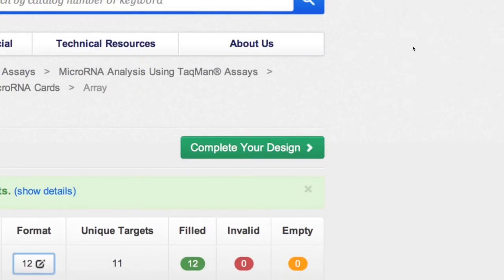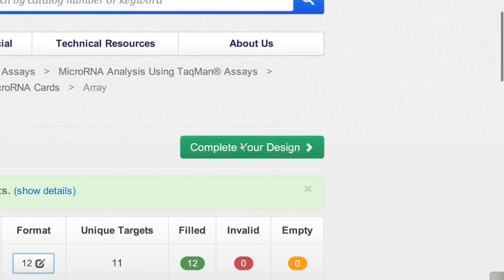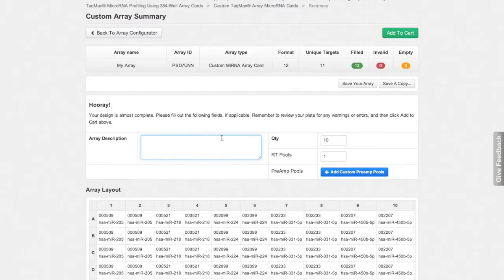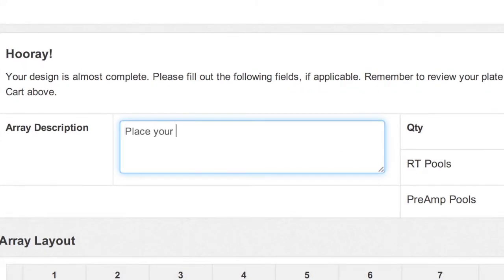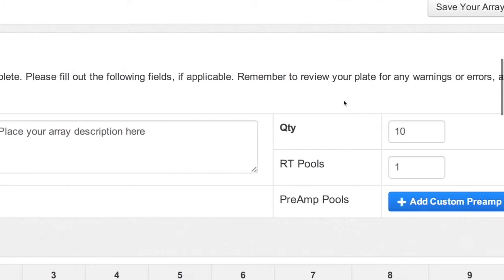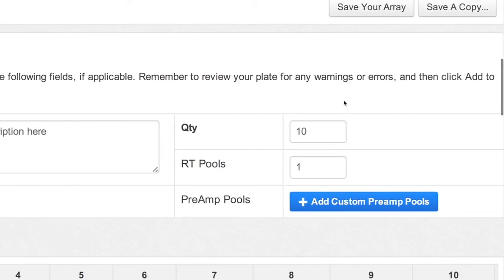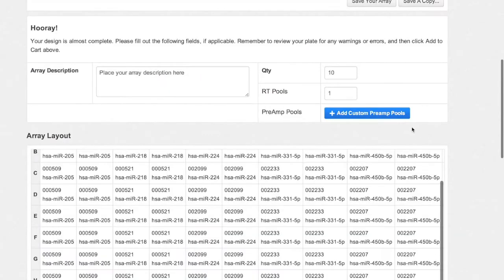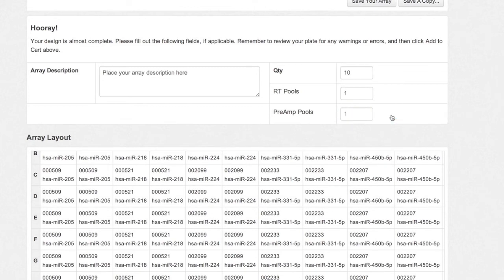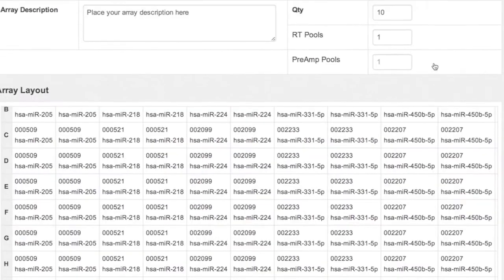Before submitting the card for final order, provide an array description and confirm the quantity. Check RT Pool Quantity, and don't forget to select Preamp Pool if you plan to include preamplification in your workflow.